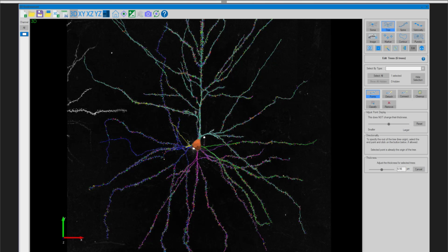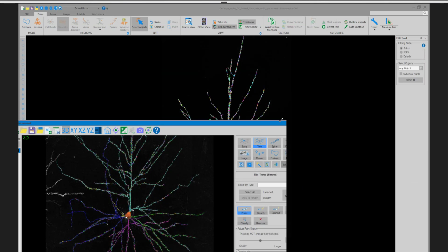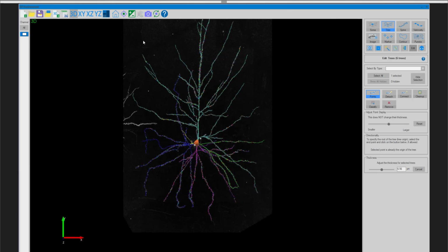There was a question here about the resolution of the screenshot, I believe. So when we're in that post-processing window, the resolution is fit to whatever the resolution of your screen is, and so whatever size the 3D window is. So if you have your three-dimensional environment really small, it's going to be at this resolution, versus if you have it on a large monitor and you have it full screen, that would be the resolution that it's taken at.